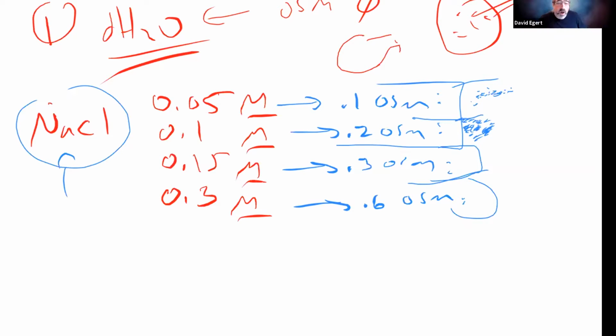Is the osmotic pressure going to be as great as test tube 2 or test tube 1 where we had distilled water? No, the concentration gradient is less. Right, so notice the concentration gradient's less, which means that there's less osmotic pressure.